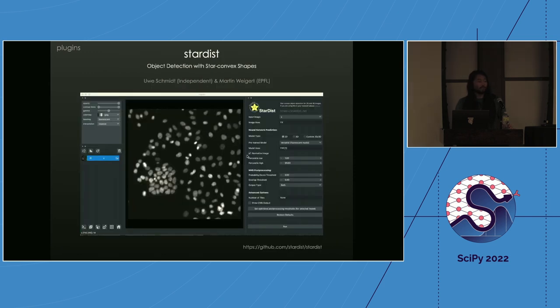One plugin we'll be using today is called Stardist. It's an object detection algorithm that's really useful for segmenting nuclei in microscopy images.